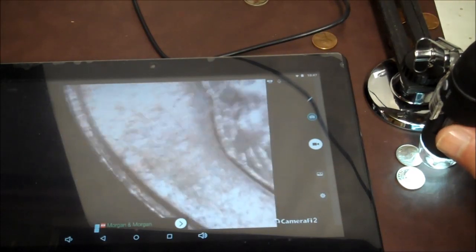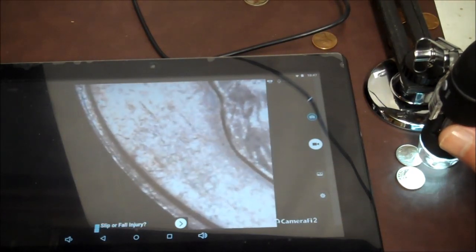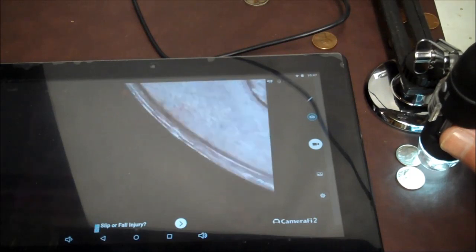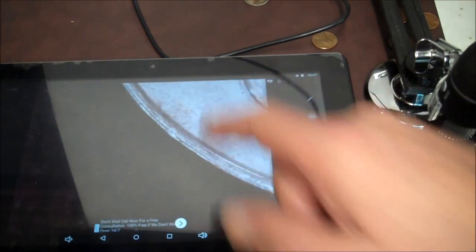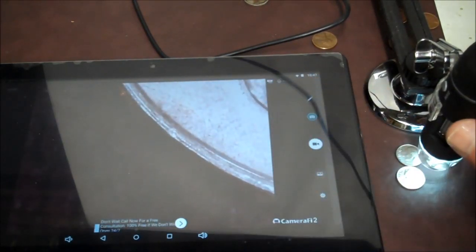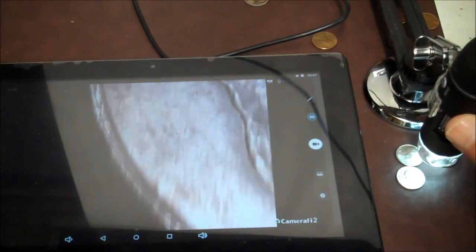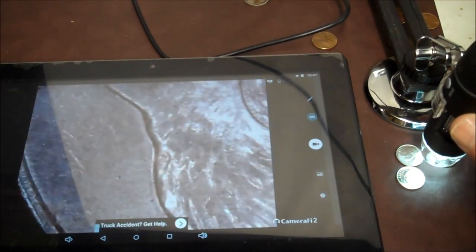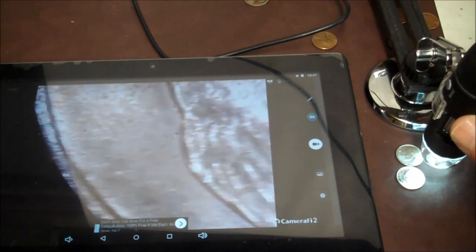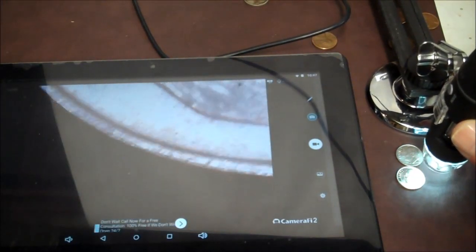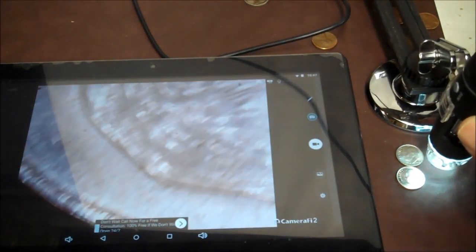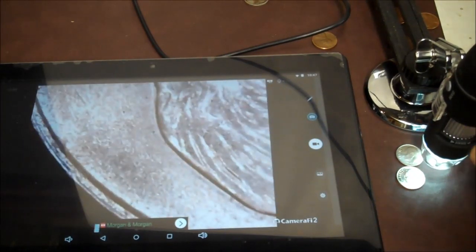They're from dust on my lens. I tried to clean it twice. First I had a big giant black spot on the side here. So I took it apart and got rid of that. And then, not realizing that I put it back together and I had even more spots. So, if you're gonna take it apart, do it in a clean area, not like me.